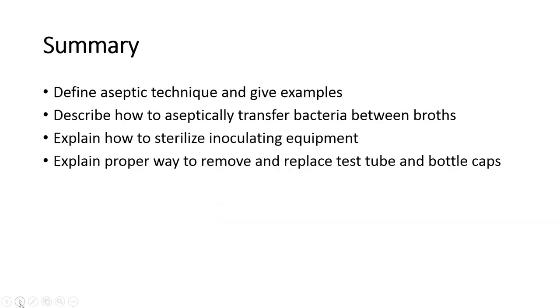So that brings us to the end of this video. In this video, I've described aseptic technique as being the set of steps and protocols that we do to help prevent contamination of ourselves, our experiments, and our environment with unwanted microorganisms. We said that technique begins when you enter the microbiology lab and you put your materials away. It continues when you wash your hands to get rid of any extra microbes that you might have brought in the lab with you, and then when you wash your desk. Remember, after that, you wash your hands and apply PPE, all of which is part of aseptic technique.